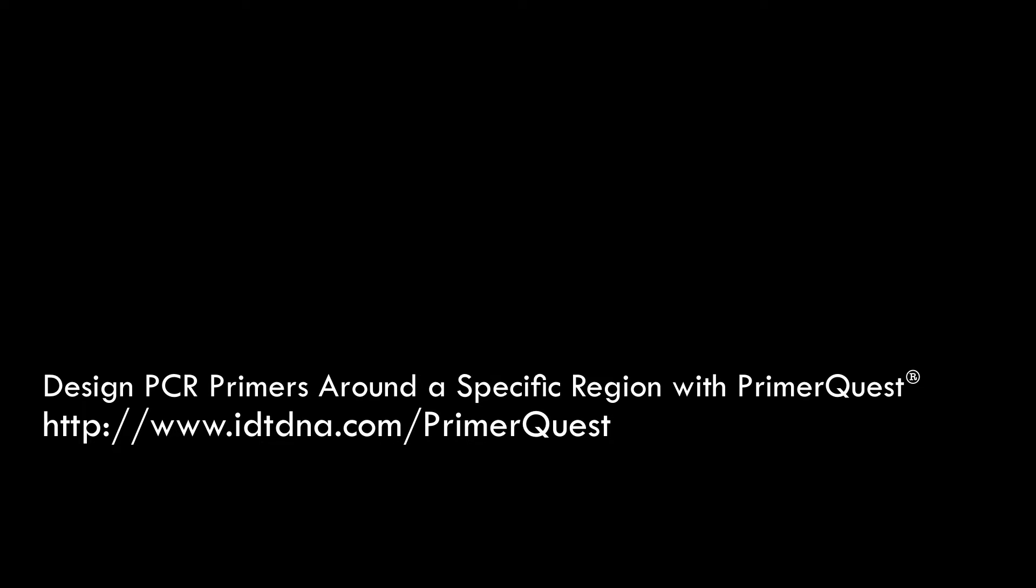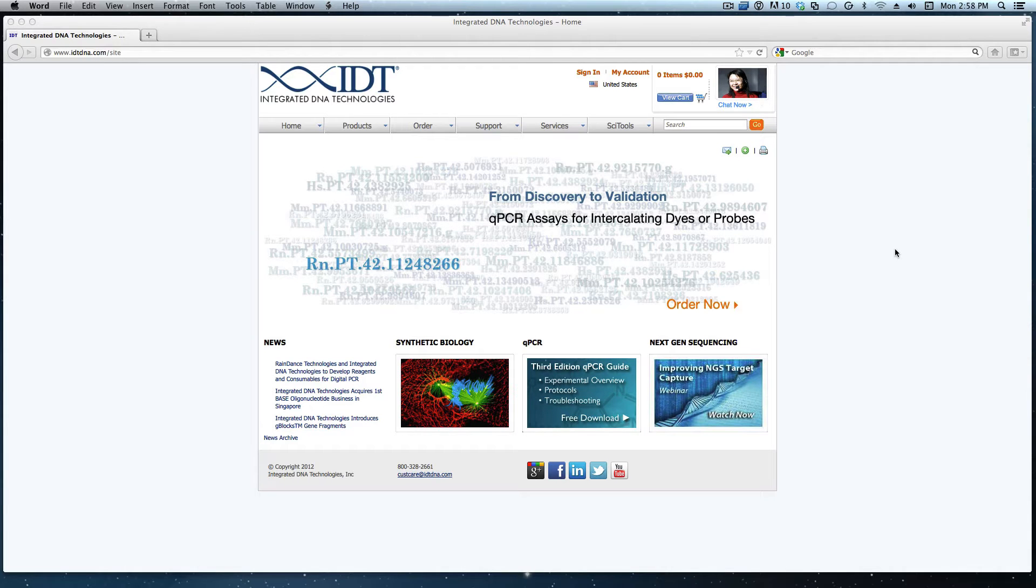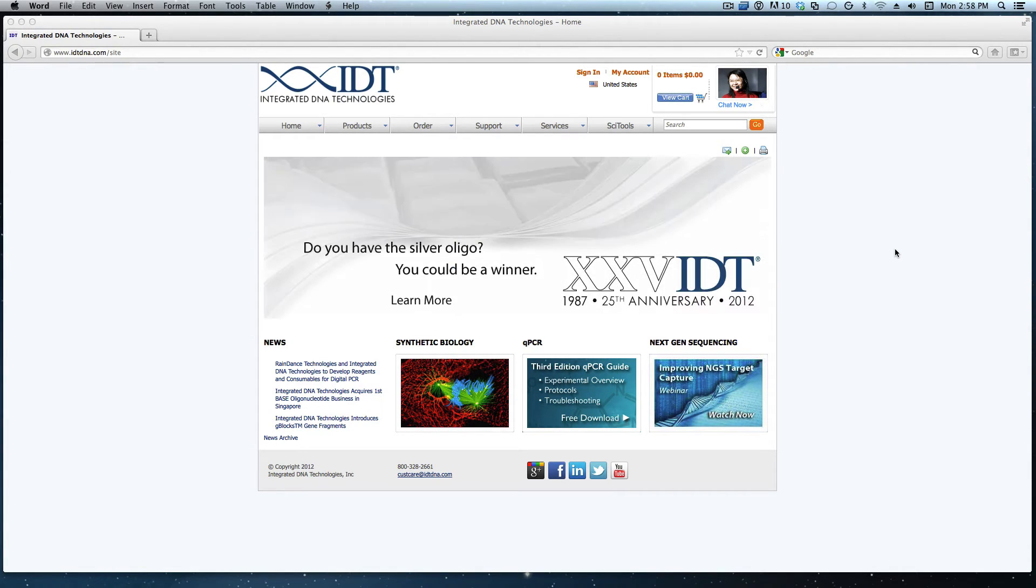Hello, my name is Afton and I work in technical support here at IDT. Today I would like to design qPCR primers to flank a specified region in my gene of interest.